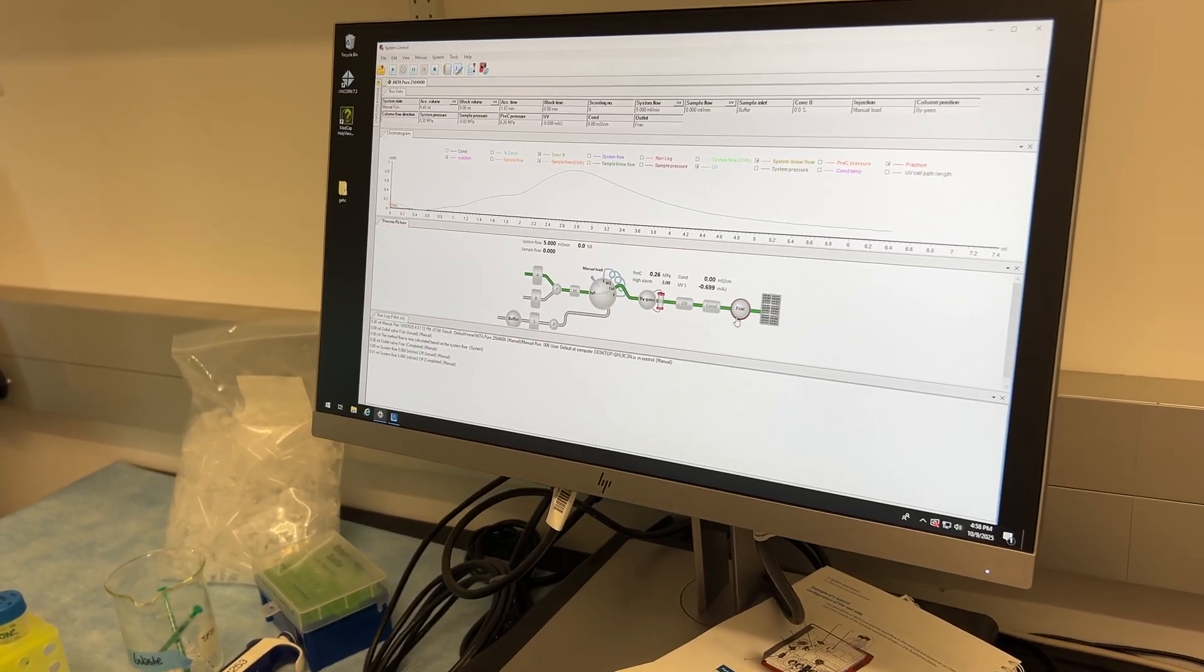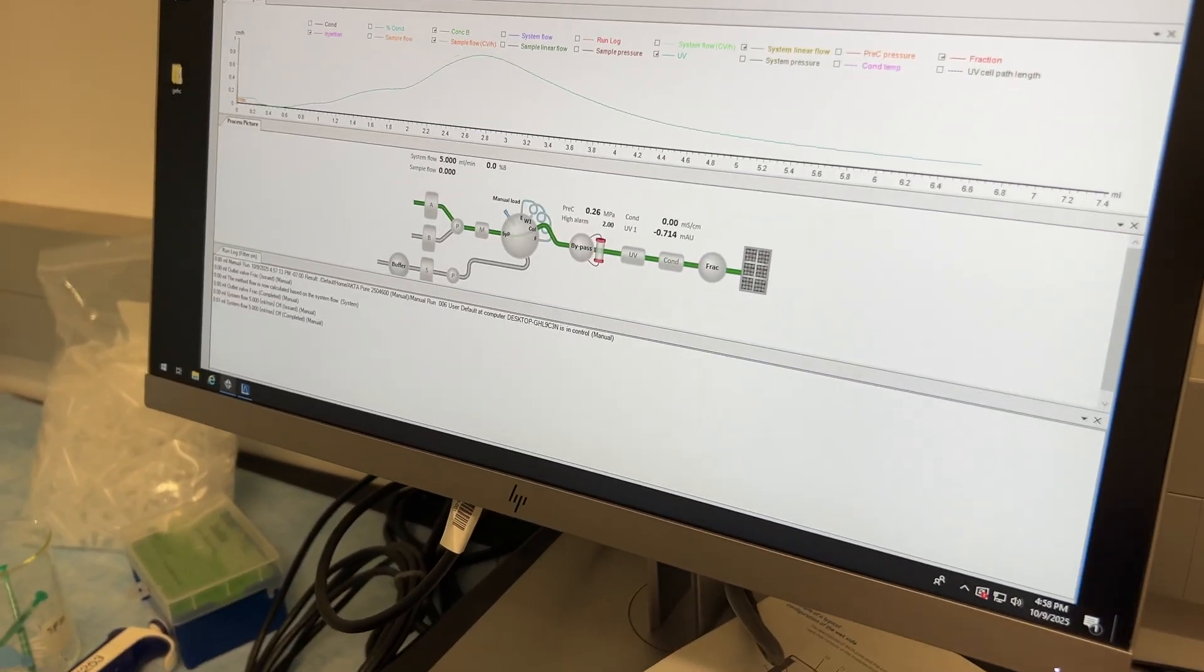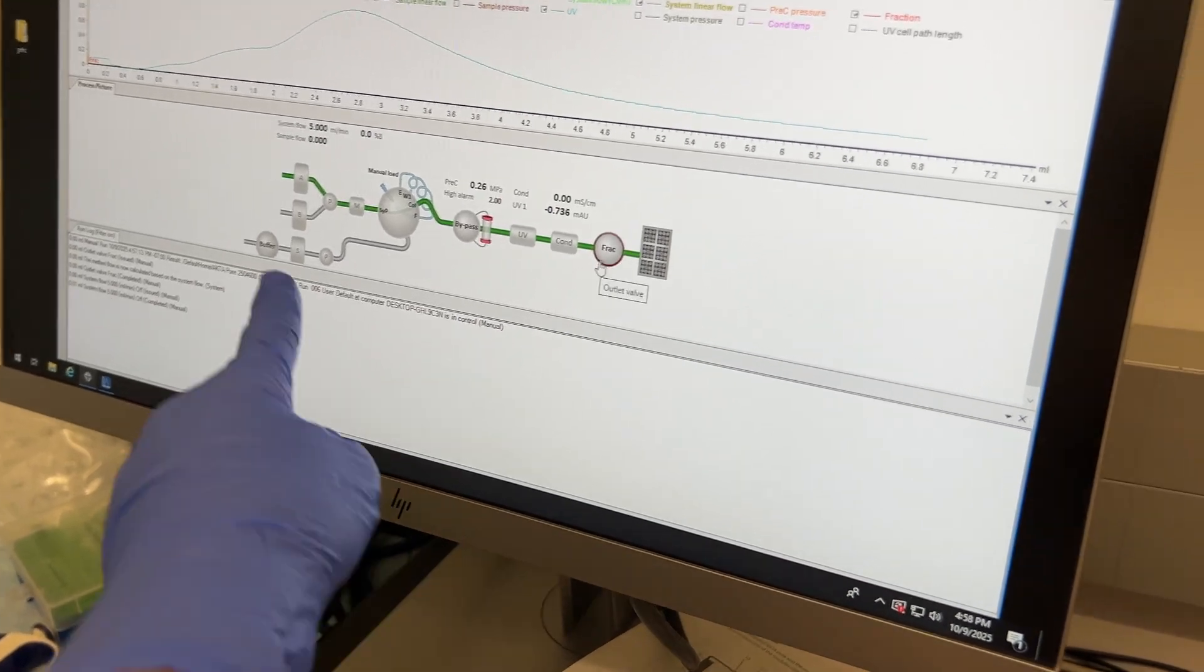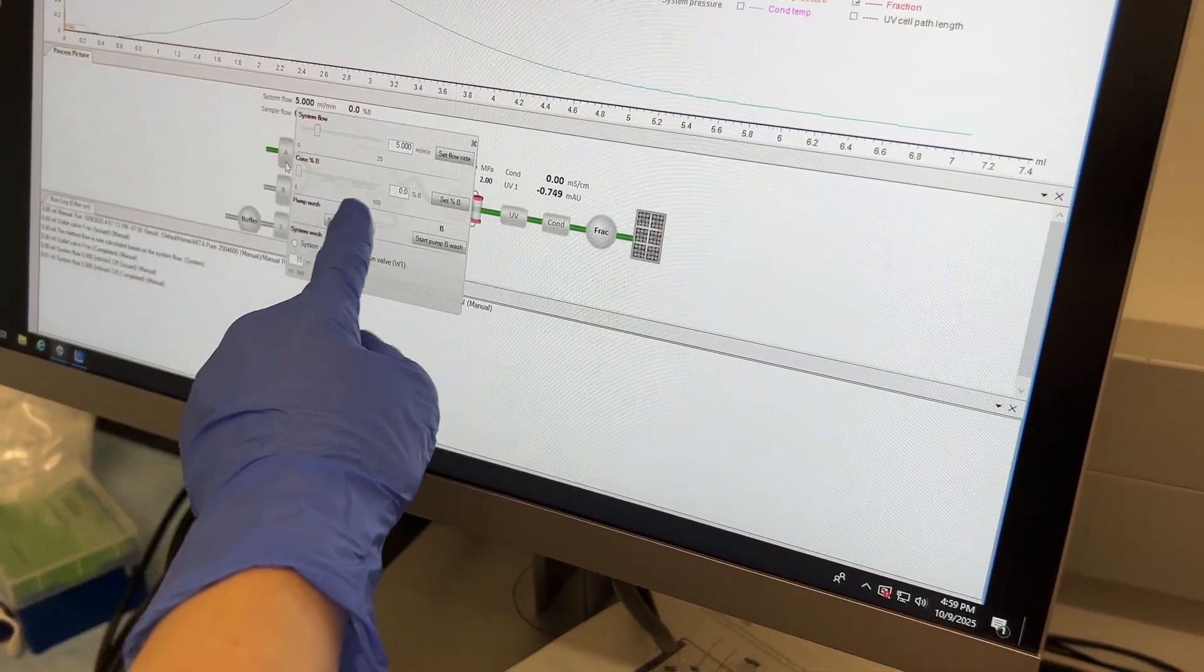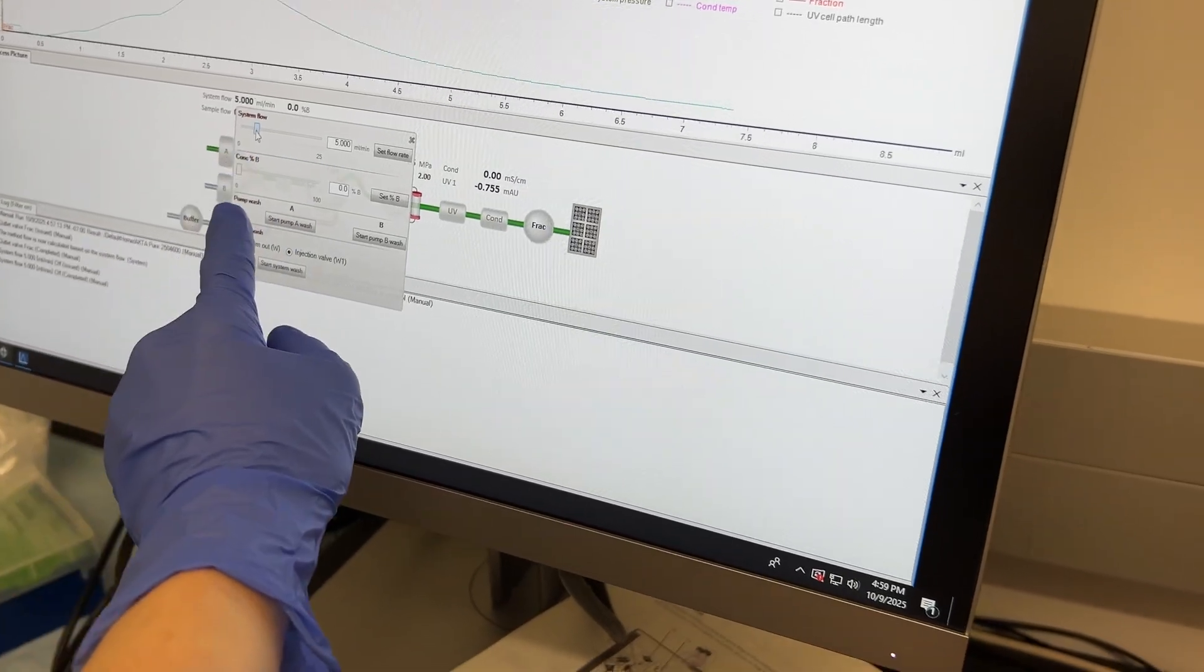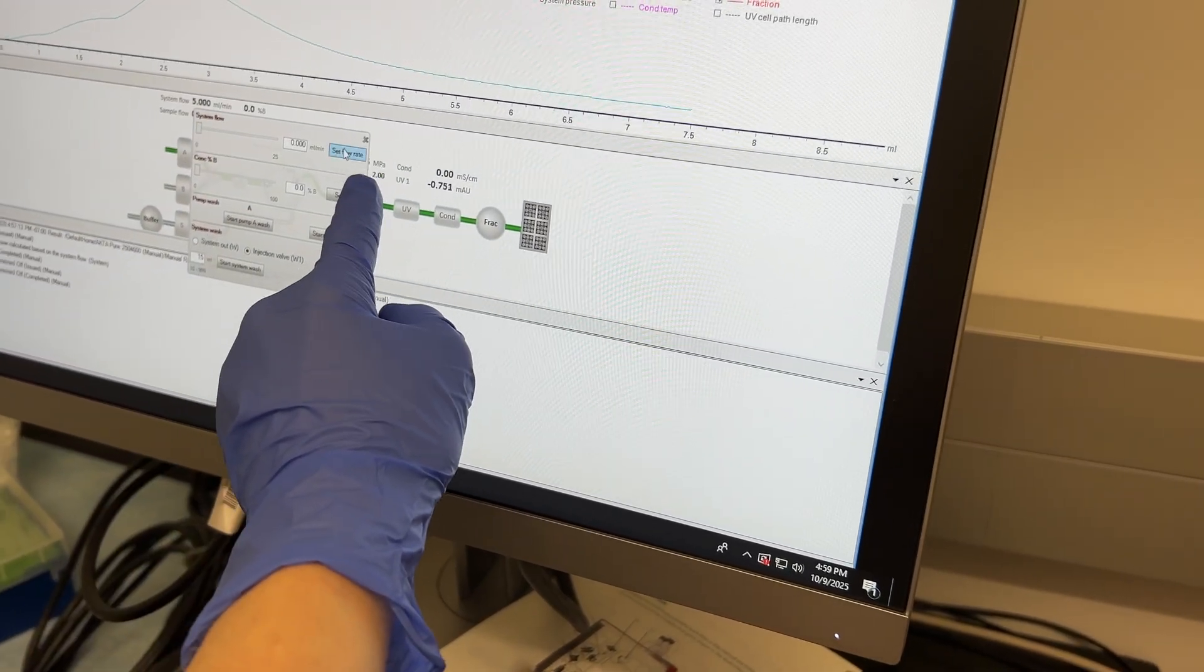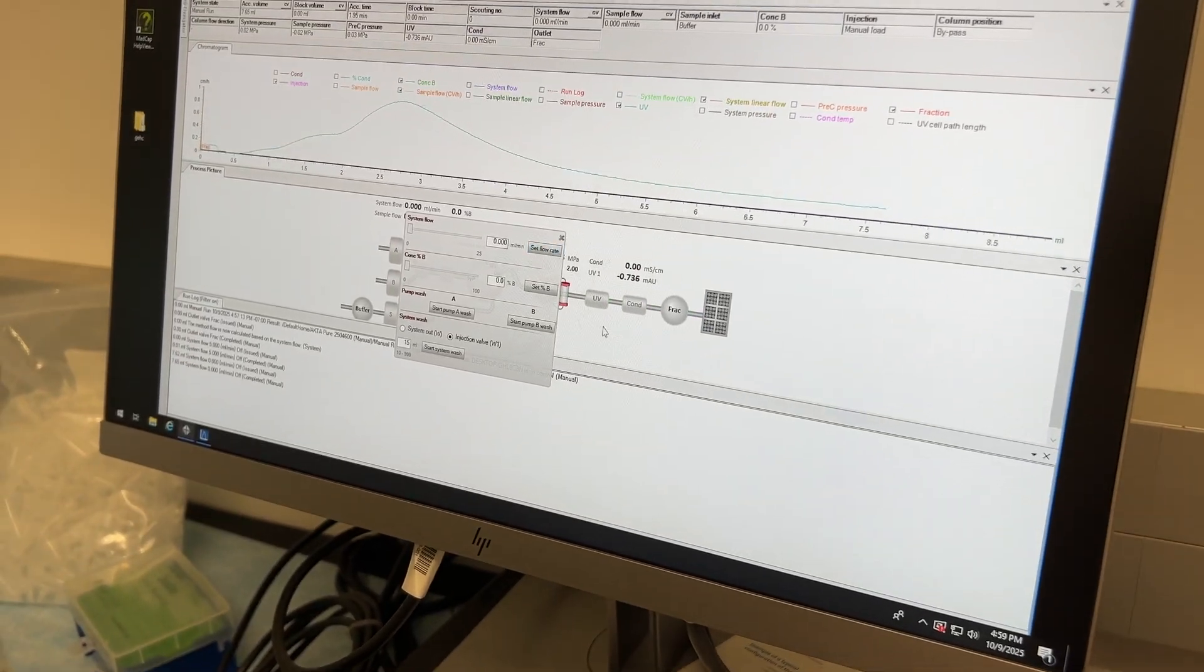So there's a couple ways you can stop things. If we just want to stop it temporarily, what we can do is we just go here and then take that system flow down to zero and then set flow rate. So that's one way that you can kind of stop things.